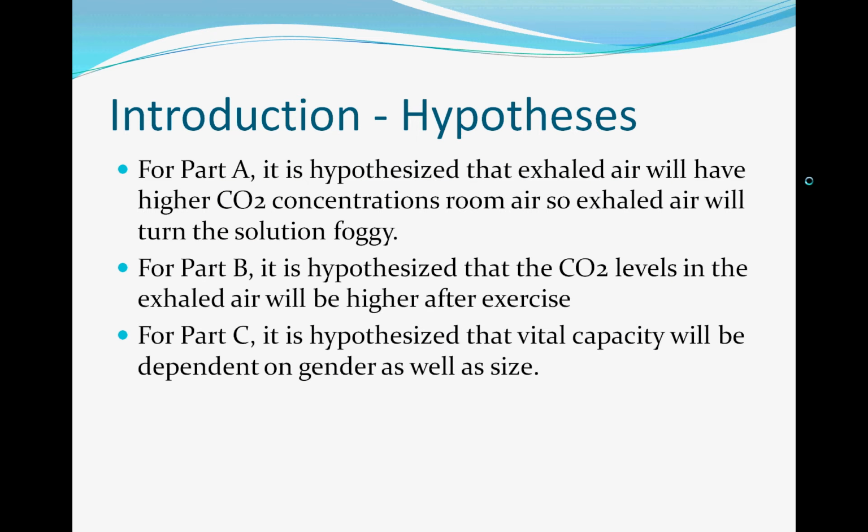So, before the experiment, a number of hypotheses were made. For Part A, it was hypothesized that exhaled air will have a higher CO2 concentration than room air. So, ultimately, the lime water solution will turn foggy. For Part B, it was hypothesized that the CO2 levels in the exhaled air will be higher after exercise. And for Part C, it was hypothesized that the vital capacity will be dependent on gender as well as size.